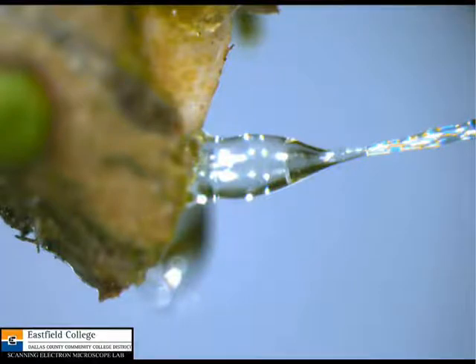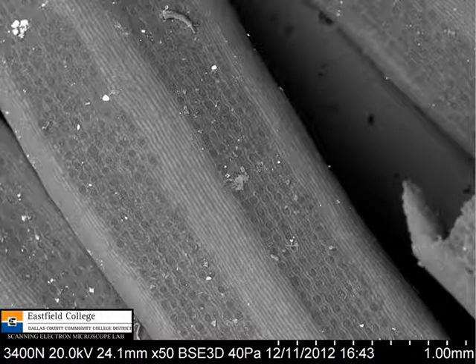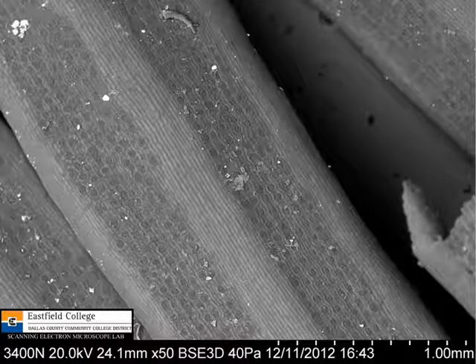So now on to the electron microscope. Here's a close-up. These are the 3 little terminal branches there. You can see some pine needles here. You can see where pine needles were attached and came loose. Here's a picture of the outer surface of the pine needle here. You can see those little pits that reflected blue so clearly before.